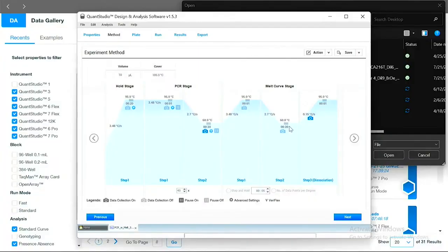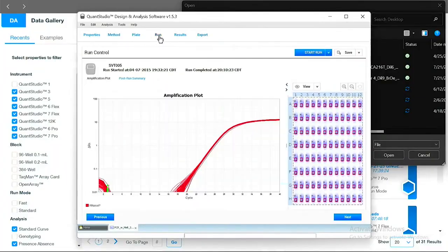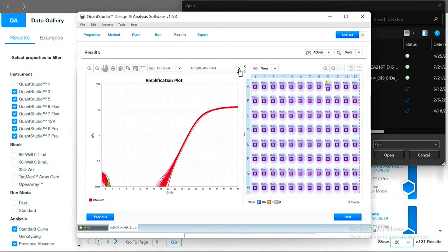We will eventually get to the point where everything falls apart in a big reaction. So it's going to be a slow decrease over time. And then eventually we get to this point where it kind of just gives up and says, ah, forget it, I'm going to fall apart. Well, we call that the melting temperature. It's where that happens in a big way.